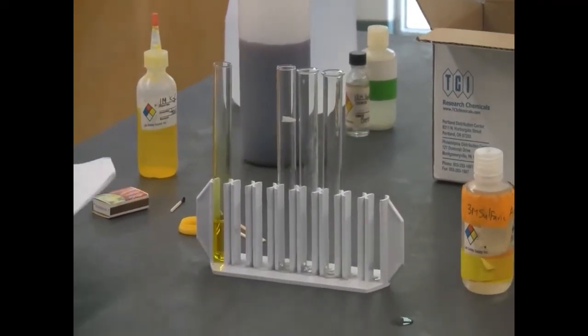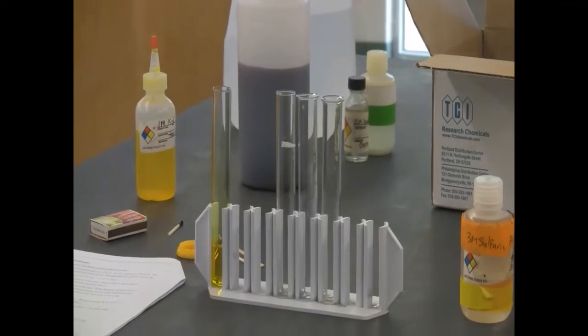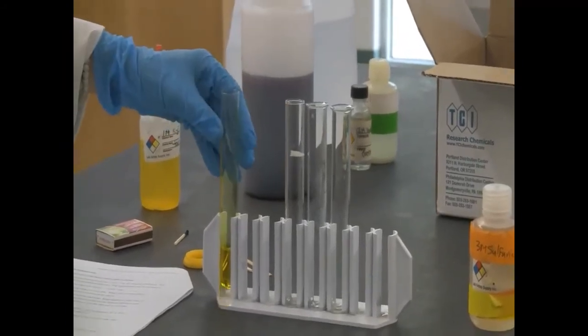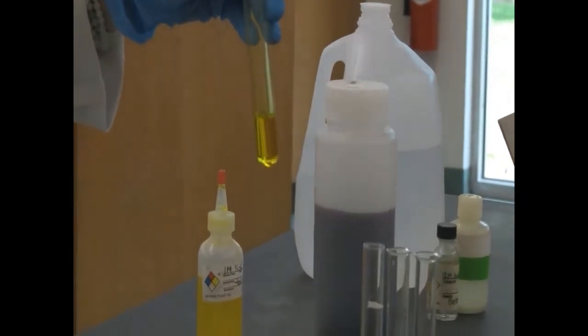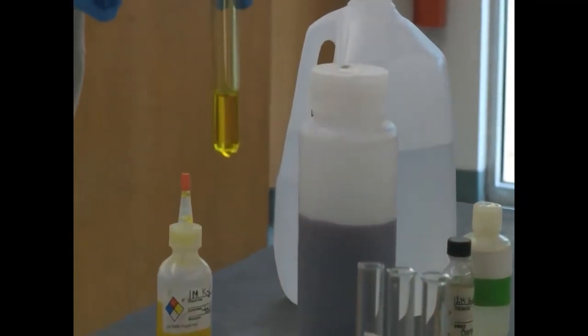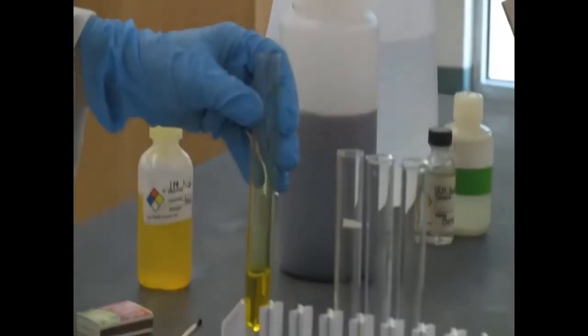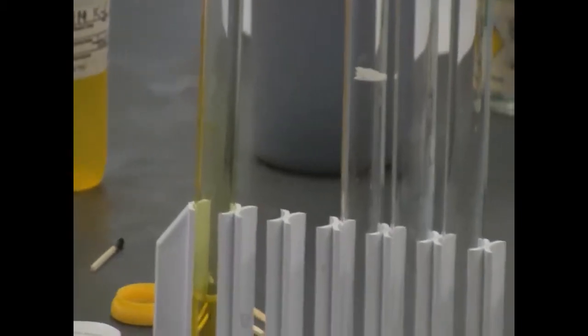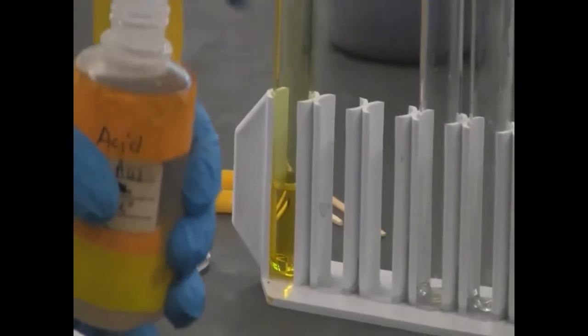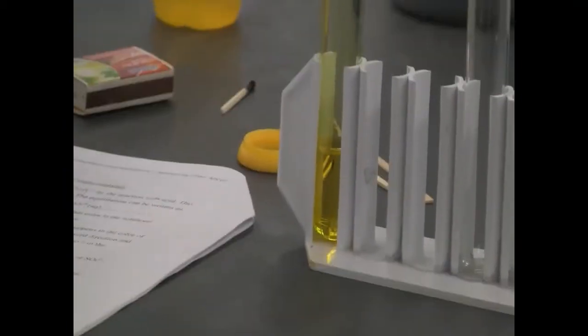So first, let's observe the color of this reagent. This is 3 milliliters of the 1 molar potassium chromate solution. Check the color, write down the color in your report. Okay. Now I'm going to add several drops of the sulfuric acid into it. Then you're going to check the color of the solution.